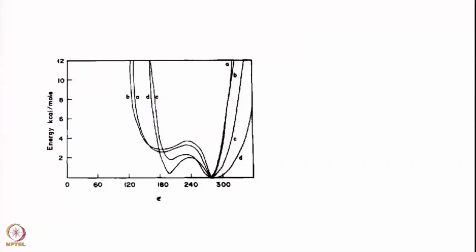So, we will continue with the structure calculation of the nucleic acids. We had these input parameters: coupling constants, which translated into the torsion angles of the sugar geometries. Then we also have some information from the energetics of the epsilon torsion angle, and next we have the information from the NOEs. The NOE information is in terms of the distances between the various protons, interproton distances. So, this comes from the NOE spectra. So, we have the input parameters.